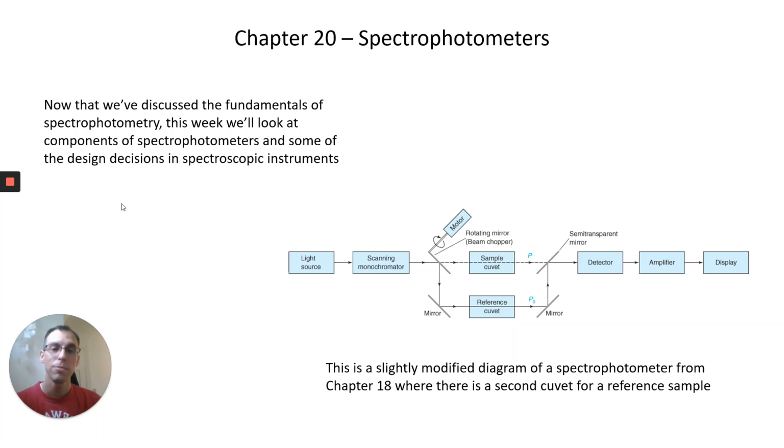And so the idea behind this chapter and the way I personally view this is there are many different techniques we could look at. So spectroscopy is, of course, something I do personally, and so this is the one that I like talking about the most. But we could talk about other things like mass spectrometry or chromatography or other types of analytical techniques that are used. And for each of these, we could have a whole discussion on how to actually construct these in different parts.